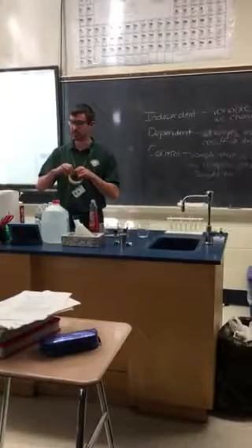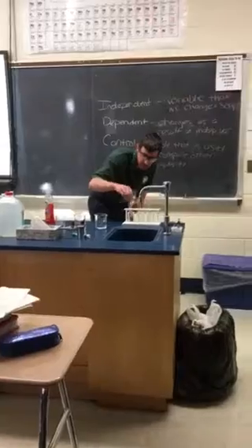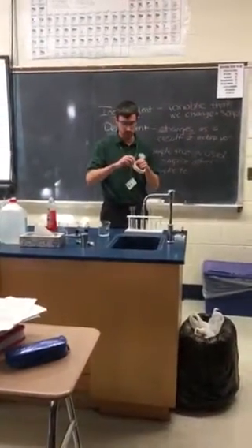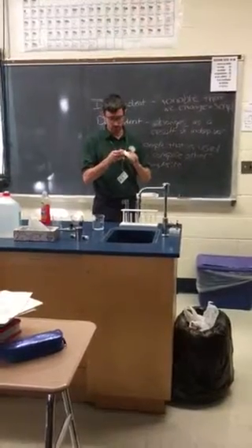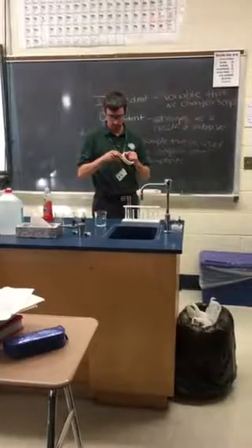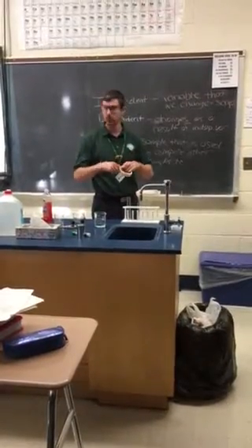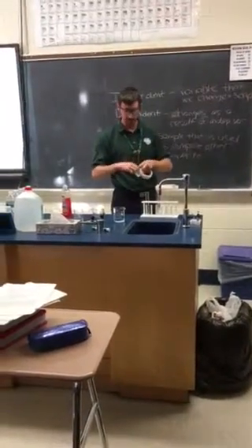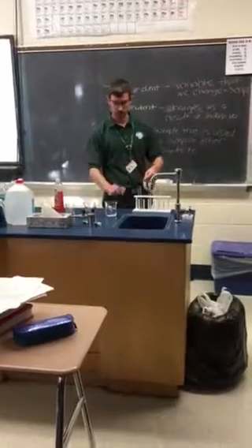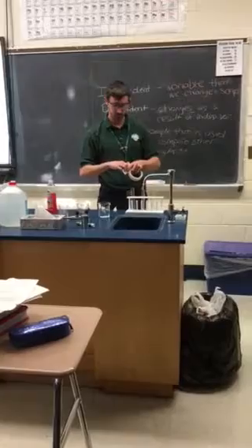So I would just recommend labeling each of your test tubes. Some of them have a white marker on the side, which you can write on. These don't. So I'm just going to take 3 small pieces of tape just to label, not label 1, 2, 3, but label as town water, control water, or distilled water.